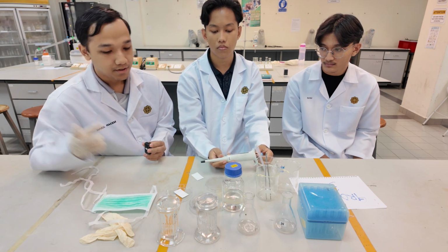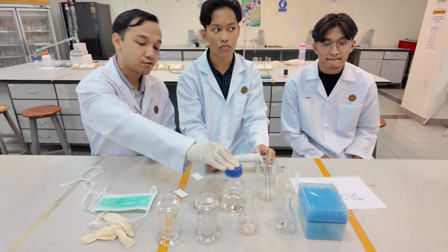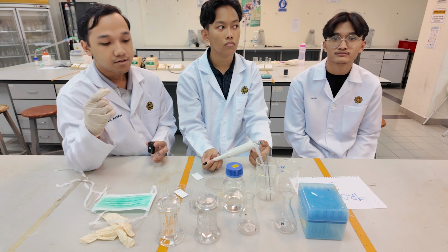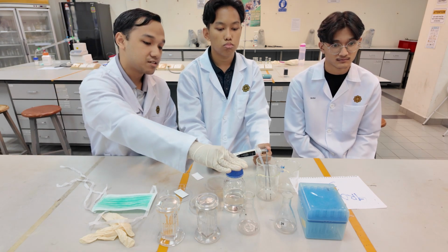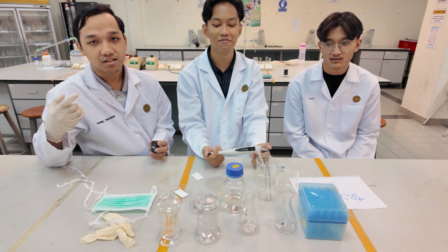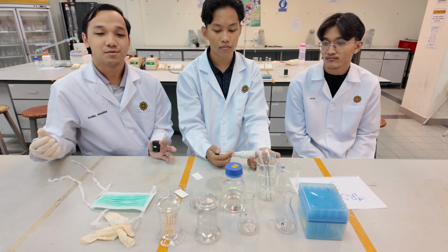And when I talk about the highly volatile solvent, we need to work in the fume hood, behind that. So we need to do this TLC experiment to prevent inhalation, to prevent us from inhaling this highly volatile solvent. Okay.